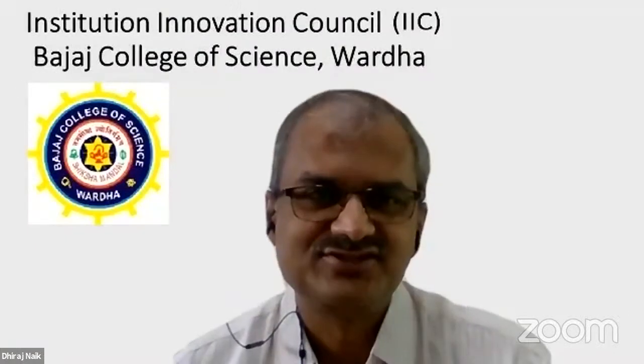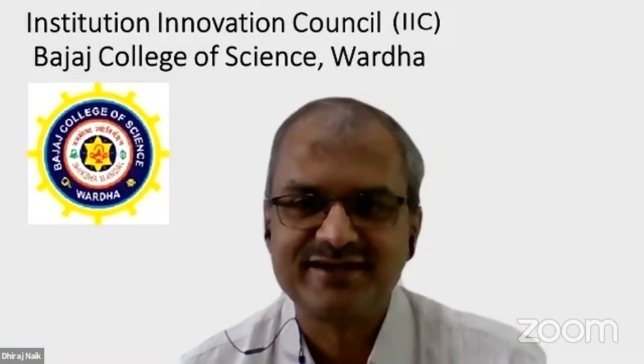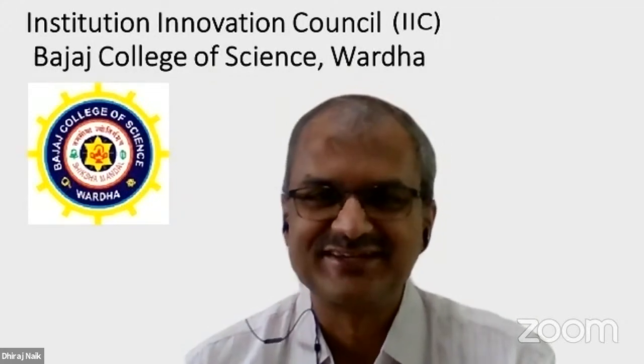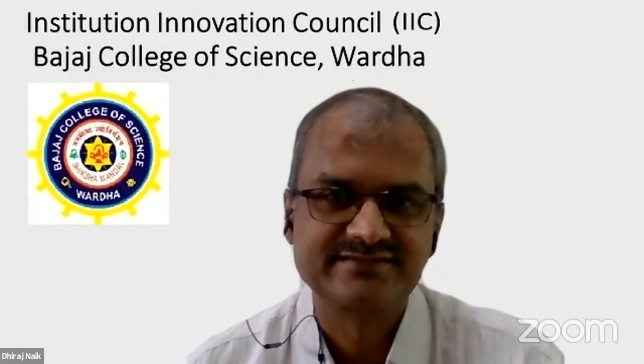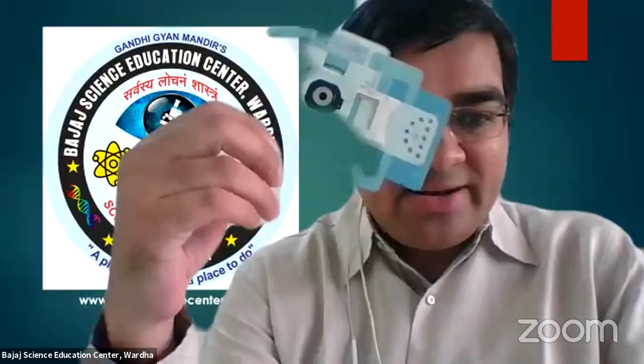Okay, there is a question in the chat box. How many lenses have you used for this Foldscope? So there are some technical questions here now. How many lenses did you say? I see. Yes. How many lenses? Okay. It would be good if you can elaborate on this, and tell us more about the different components.